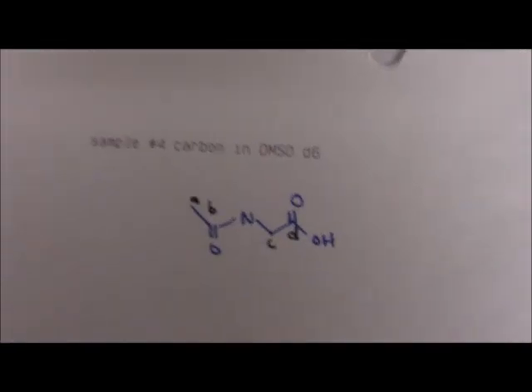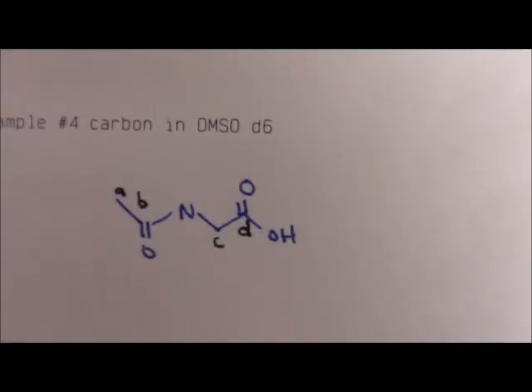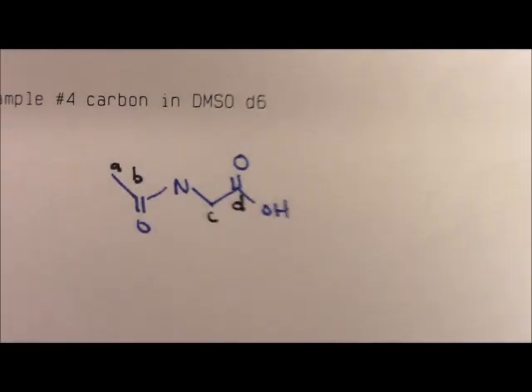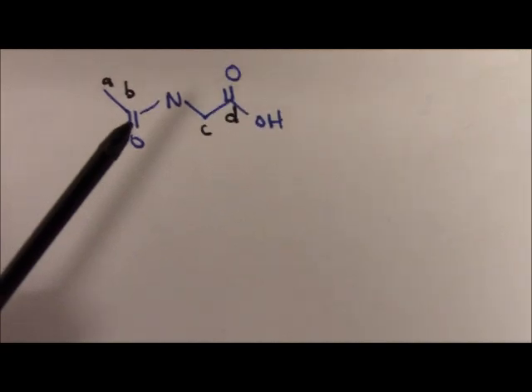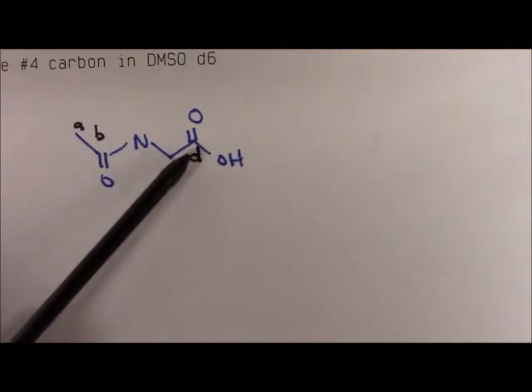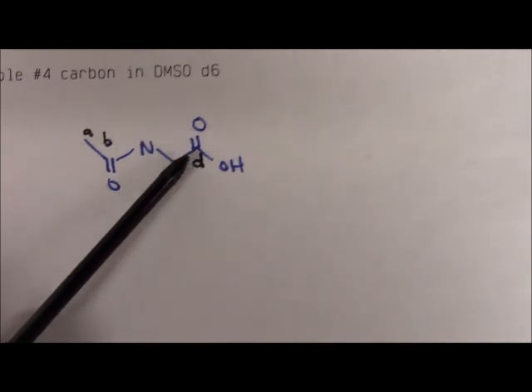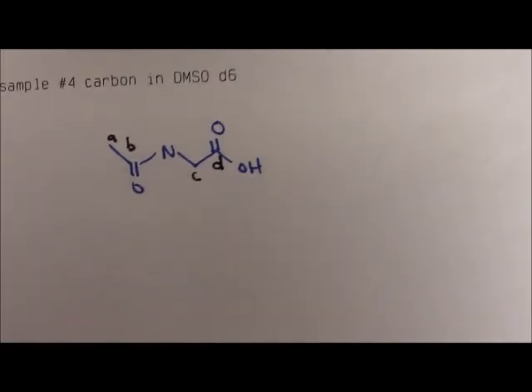And then we move on to the carbon. Let's do carbon 13. You always label the carbons different by symmetry, and you can see I've labeled this one A, B, C, D. Notice you have two carbonyl carbons. One is an amide, one is an acid. Both are somewhere between 155 and 185. And the numbers for this one, 170, 171, and the carbon, right?